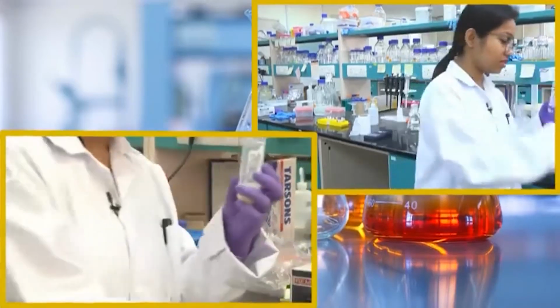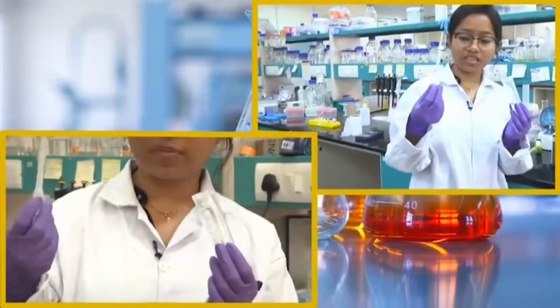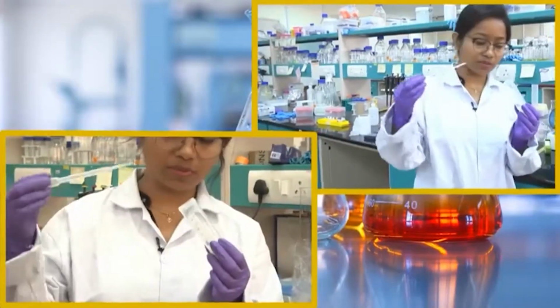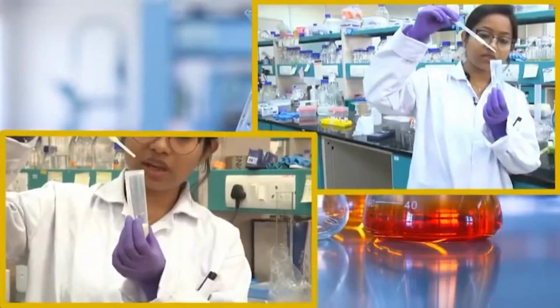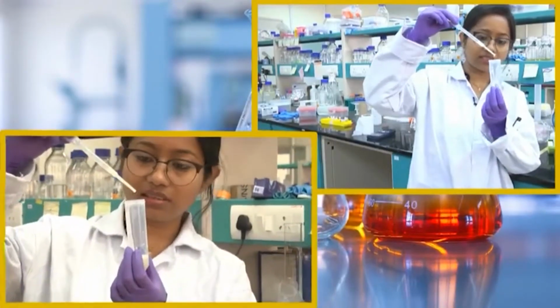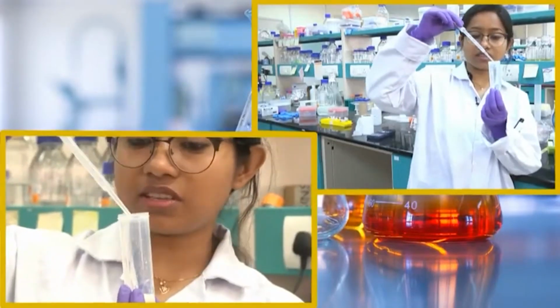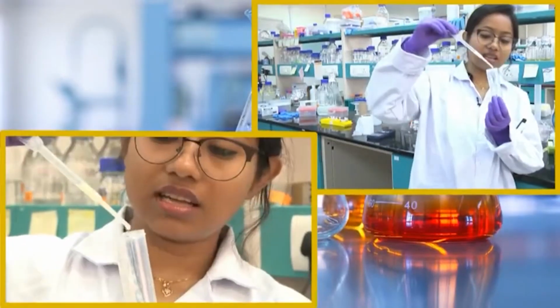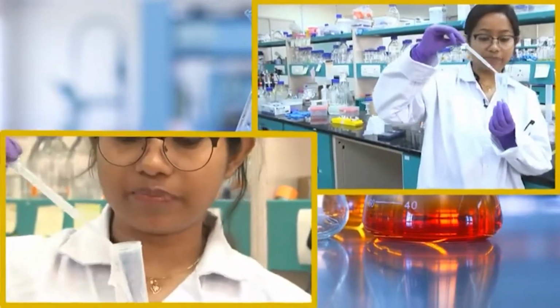Now, if you see the solution, I am here using a Pasteur pipette. It is a plastic Pasteur pipette. The solution is quite runny, so it is forming proper drops. It is not viscous or anything. So, in this case basically the cells are not lysed.